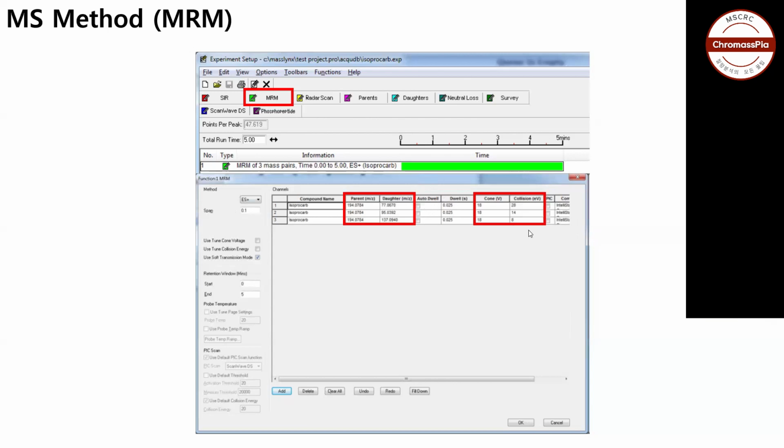Can you please explain whether we need to optimize the dwell time or not, and what the effect is if there are fewer or more fragments? Actually, I always use just AutoDwell. I never optimize the dwell time, so I'll check about it. Oh, okay, thank you.